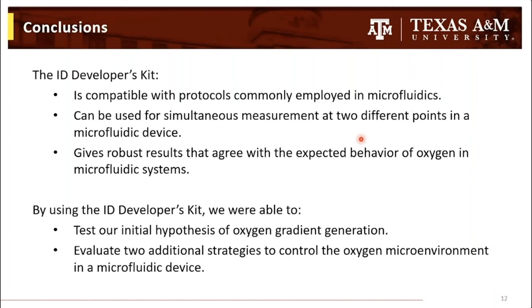By using the ID developer's kit, we were able to, first of all, test our initial hypothesis of oxygen gradient generation. And secondly, we were able to evaluate two additional strategies to control the oxygen microenvironment in a microfluidic device for co-culturing of different cell types.